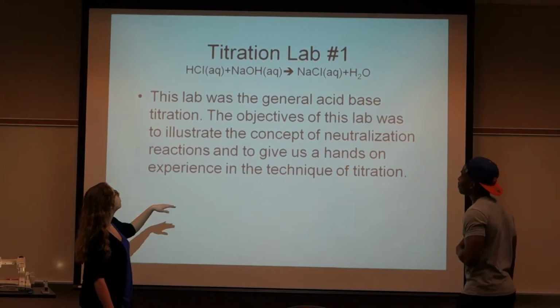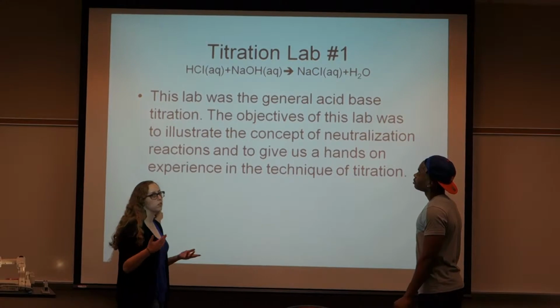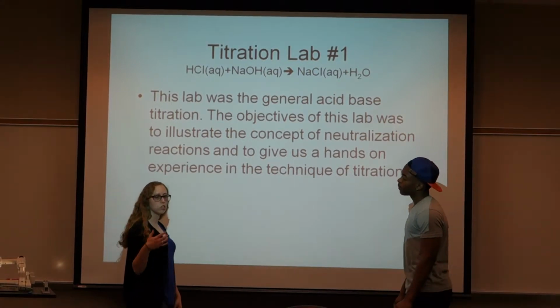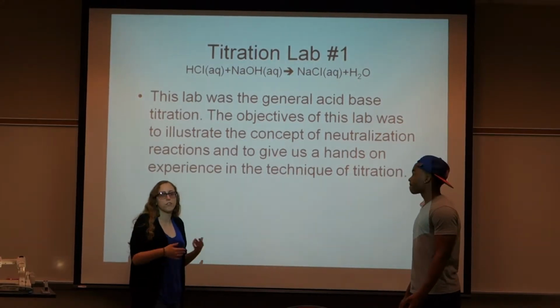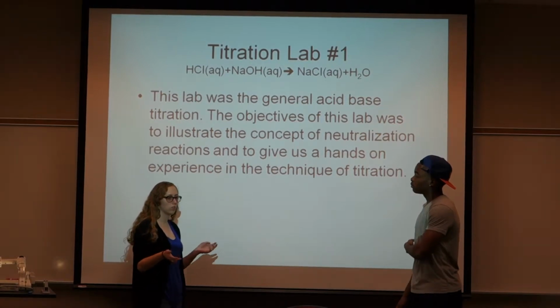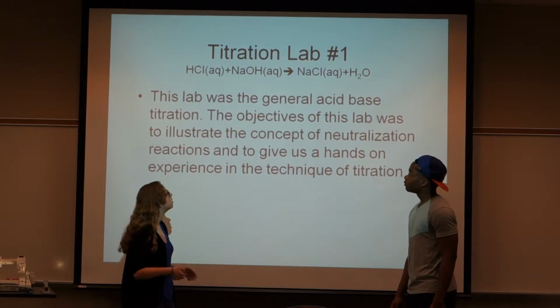In the first lab, we have hydrochloric acid and sodium hydroxide, which mixed together made sodium chloride and water. This lab was just to see how titration worked, how to use the burette, how to use the flasks, so we know everything, and to understand the concept of how a neutralization reaction works.